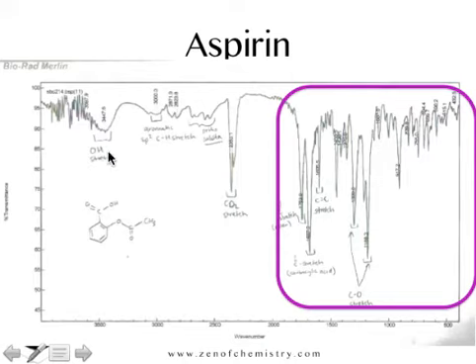So that's our OH stretch. The other one I really want to point out is our C double bond O stretch. That's the C double bond O there. And I've put CO2. Sometimes if you've got a molecule and you're analysing, you're not expecting to see a C double bond O in there, sometimes it can be due to carbon dioxide. So it's not CO2, it's a C double bond O, or carbonyl stretch.